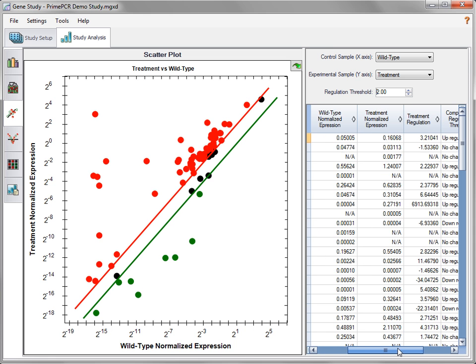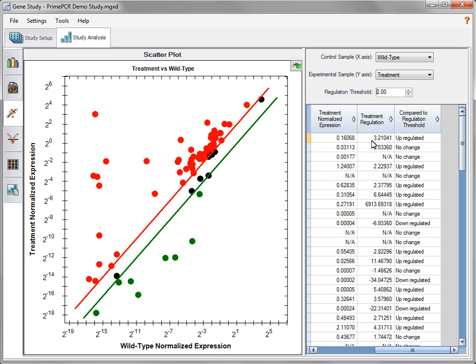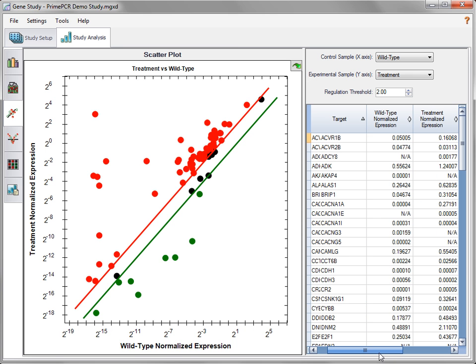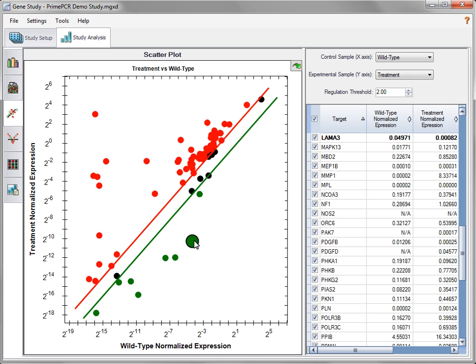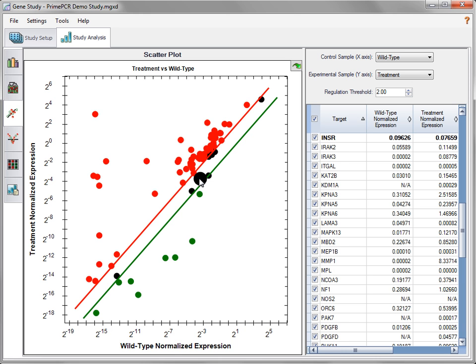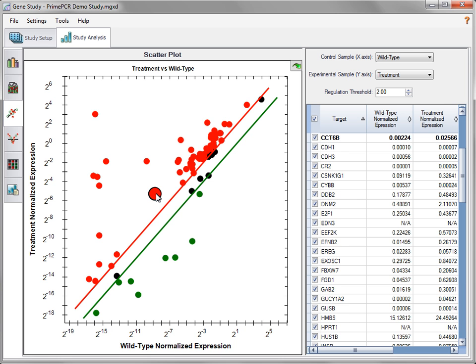In addition to normalized expression, the spreadsheet also contains values for regulation and regulation compared to threshold setting. When individual data points in the plot are moused over, the corresponding line in the spreadsheet is highlighted. Conversely, positioning the cursor over a line in the spreadsheet will cause the corresponding plot data to be highlighted.